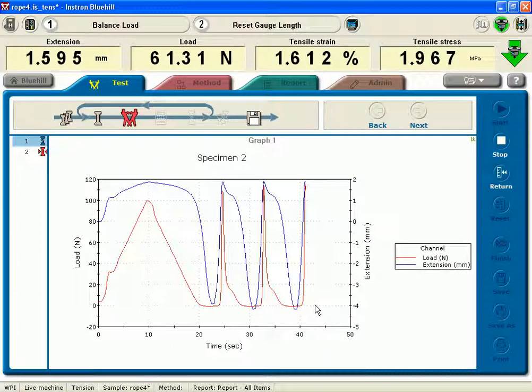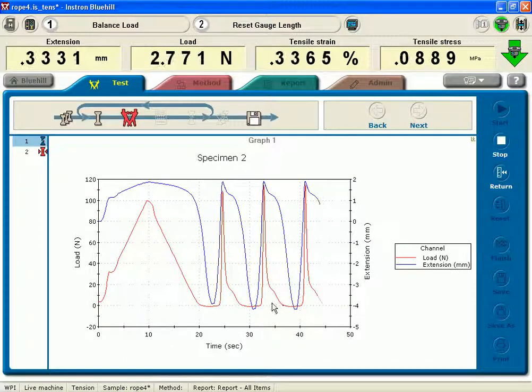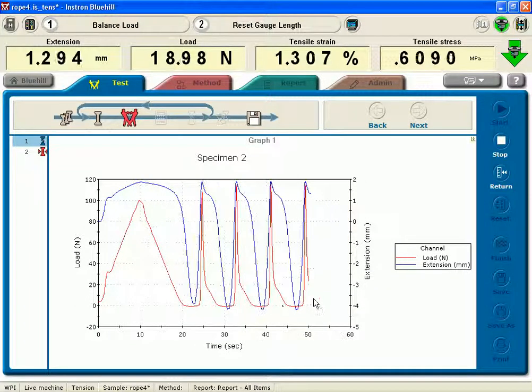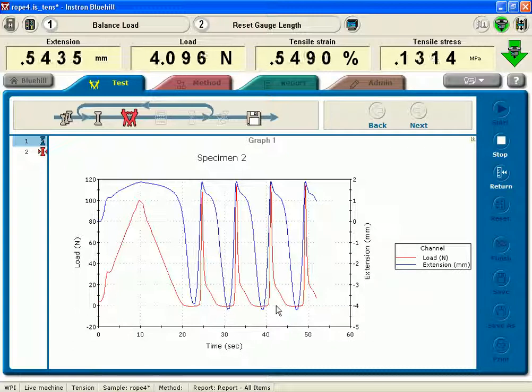Goes down to zero, shoots up, and again, there's some give in the material, so it's not able to ramp at 600 newtons per minute and then come back down at 600 newtons per minute because of the compliance of the sample and the non-linearity of the sample. Again, this is polypropylene rope.